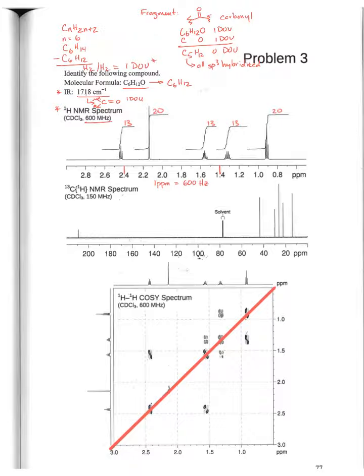So what I've done already is measured the height of the integral, and those numbers are in red. All I did was take a ruler and measure from here, extend this line. Then with a simple ruler I made measurements, and these are in millimeters. So that gets the height, and that's equivalent to the area under the curve here, and what we're looking for is a ratio of what these peak heights or areas are to one another.